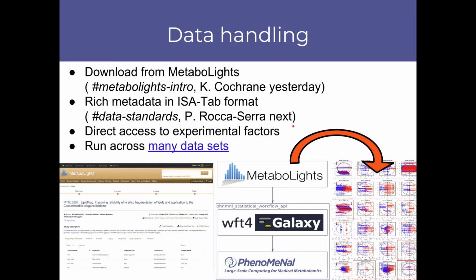with one sample. And that then becomes interesting when you want to do the statistical analysis. And if nothing else, it would give you which samples are blue and which samples are red in the PCA plot, for example. So we see that you start from MetaboLights. Via MetaboLights, we can go into Galaxy and then create these outputs. And what I've shown in the demo is how to do that through the web interface, but we also have ways to do that on the command line.